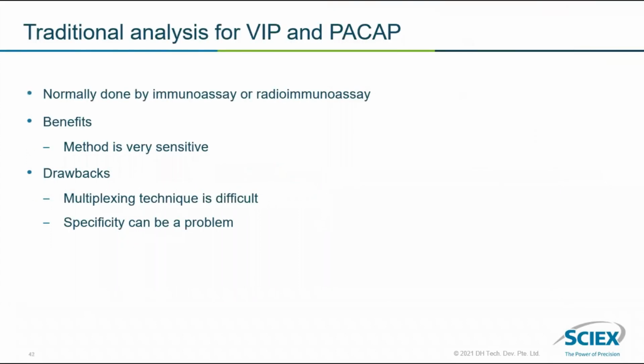Normally these kinds of challenging peptides are traditionally run by radioimmunoassay and/or immunoassay. This traditional technology has benefits: the method is very sensitive.